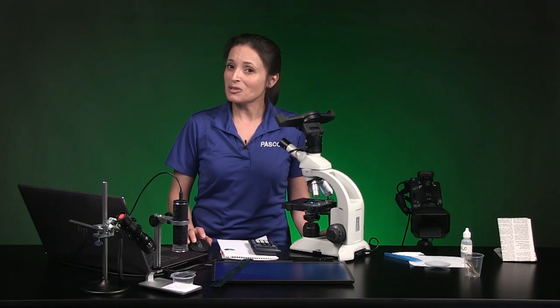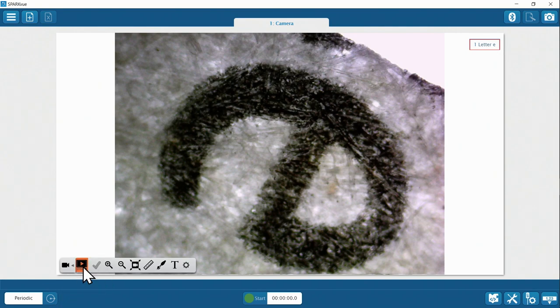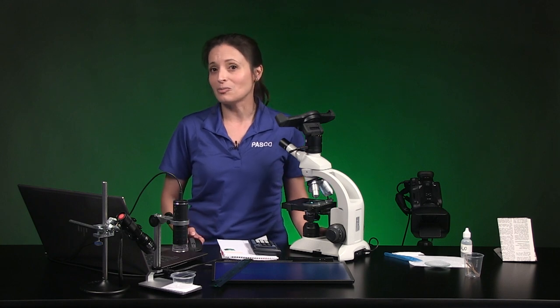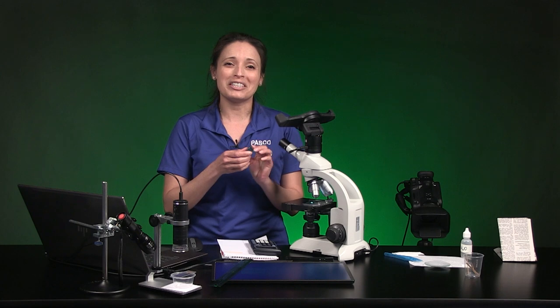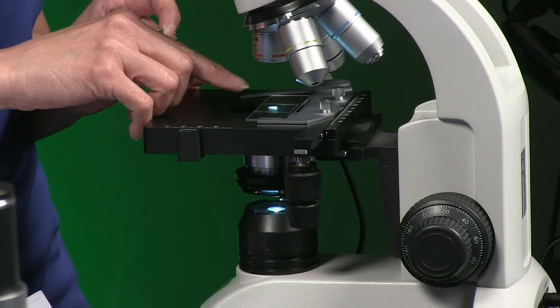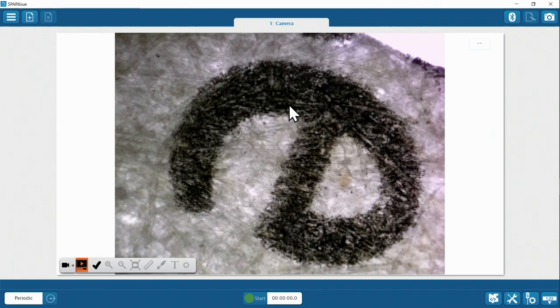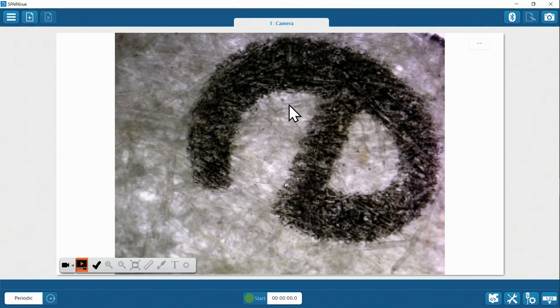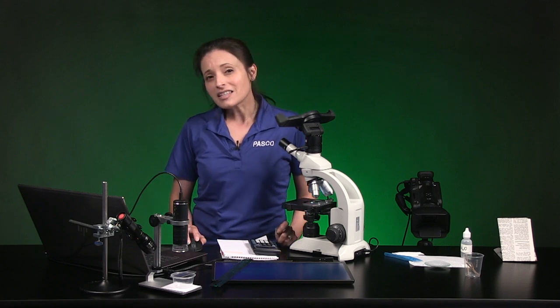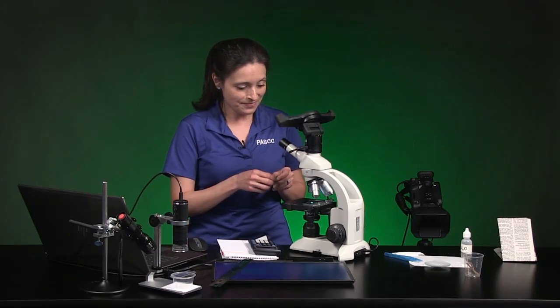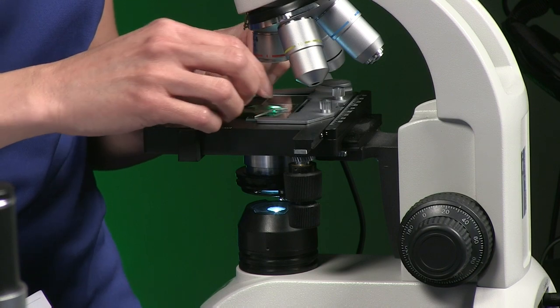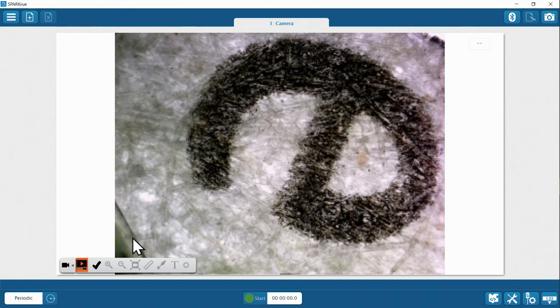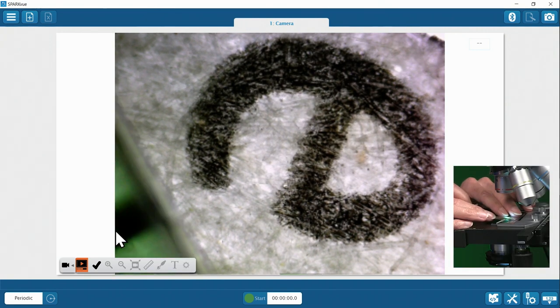Before moving on, I have to get the live microscope feed back — in the Camera Tools menu, select Preview. Now my feed is live again. We're going to calibrate the digital measurement tool in SparkView so it can measure length, but I need a reference length in the snapshot — a known distance to point to. I'm adding a chunk of a clear ruler with the metric side tucked in close to that letter E. I'll move the slide so I can still see the whole letter while making room for the ruler piece.